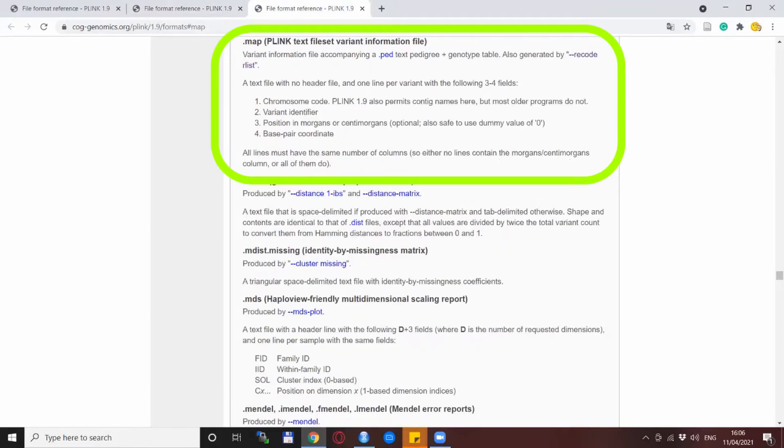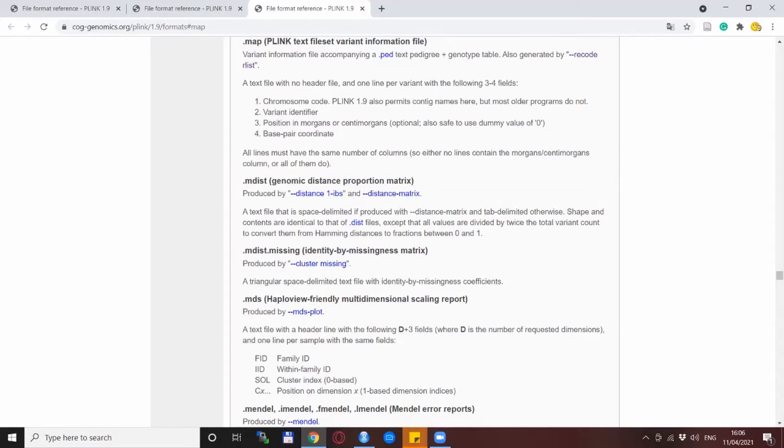And the last thing we need is a MAP file which we also know from our previous encounters with genotype data. And this is the classical one. First column the chromosome ID, second column the SNP name, third column is a Morgan position but could be also a zero, and the fourth column is the base pair position.